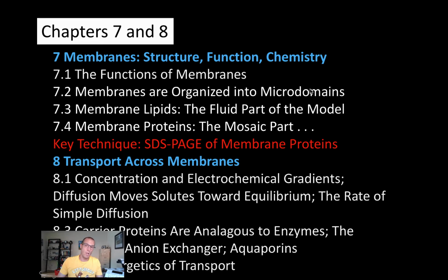Last time we talked about proteins a lot, and so the key technique I'm going to introduce to you in this part of the semester is the technique of SDS-PAGE. Here it says membrane proteins and SDS-PAGE, but this is a technique which can be used for proteins isolated from anywhere in cells. Doesn't have to be membrane proteins, but it goes reasonably well here. So let's talk about that.